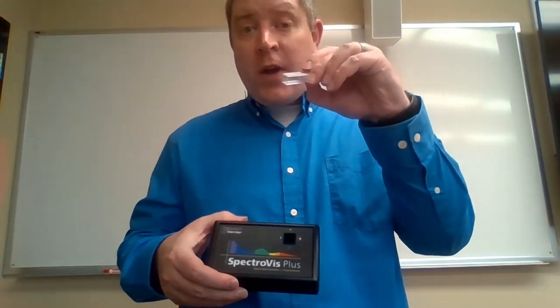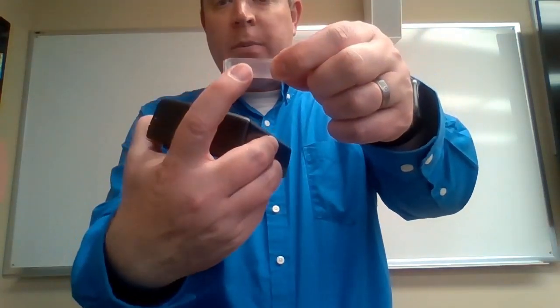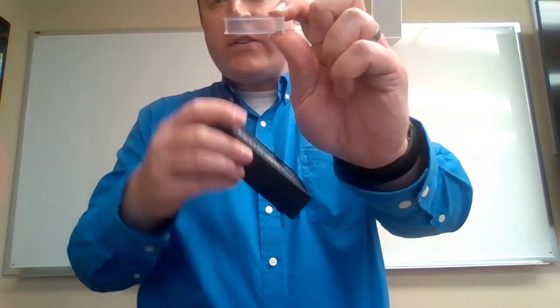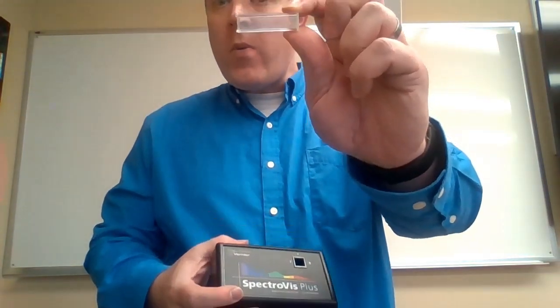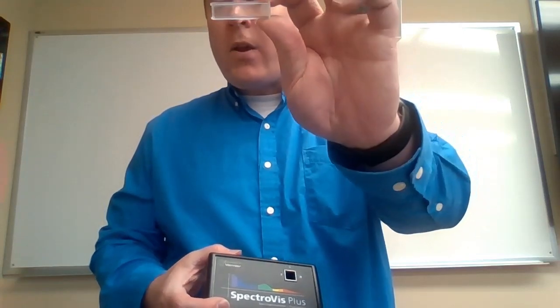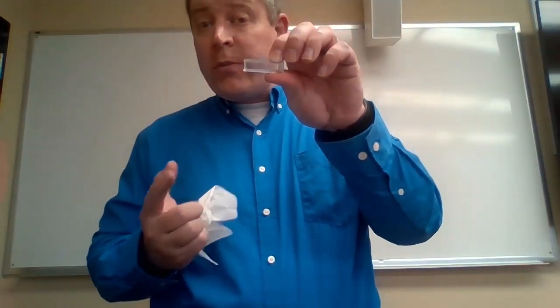Now, with that cuvette, there are two different types of sides. There are these scalloped edges and flat edges. The flat edges are where we want the light to go through. The scalloped edges are where we want to hold it. We do not want to hold on the flat sides. And your fingerprints will scatter or absorb some of the light.